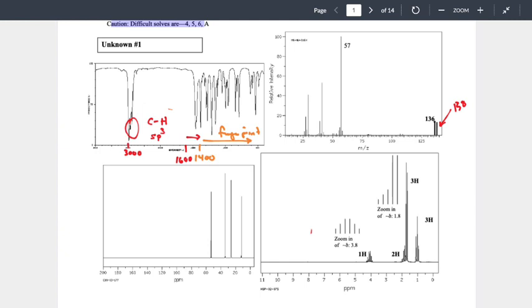Formula, H2O is a formula, right? If I know the formula H2O, what other information can I pull out of that? Tons of information, but work with me here with the emphasis on the fact that we're looking at mass spec. I would know the molecular weight for water because hydrogen weighs 1. There's 2 hydrogens, so there's 2 mass from hydrogen. And I know oxygen is 16. I would know the molecular weight is 18. Sweet. So the formula is related to our molar mass.